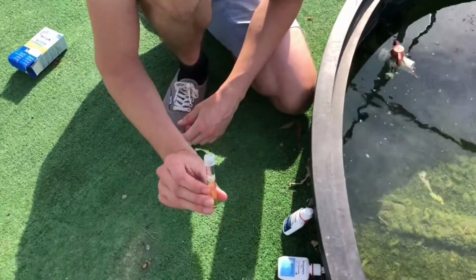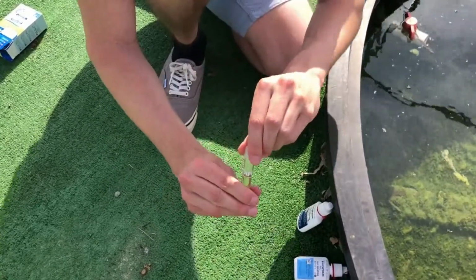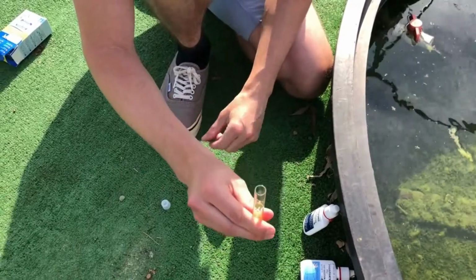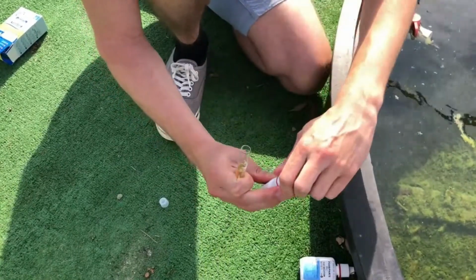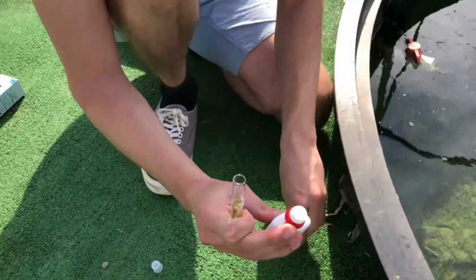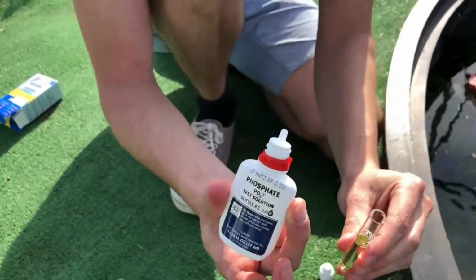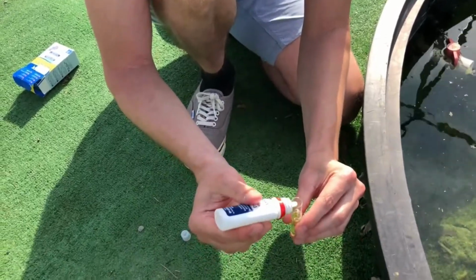Okay, immediately after adding the 6 drops from the first bottle and shaking, we add in 6 drops from the second reagent bottle. Phosphate bottle 2, add 6 drops.